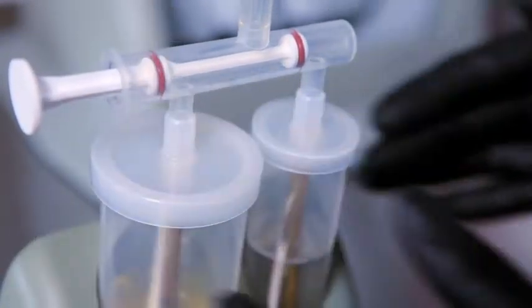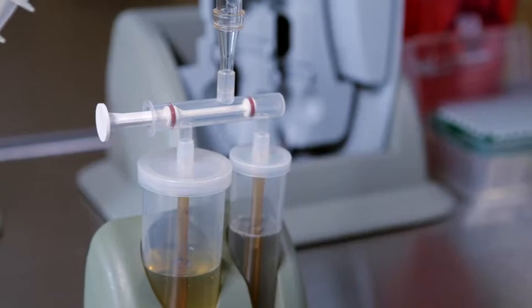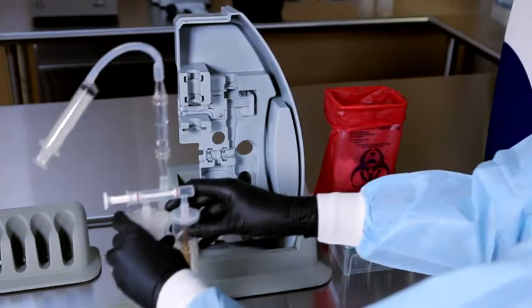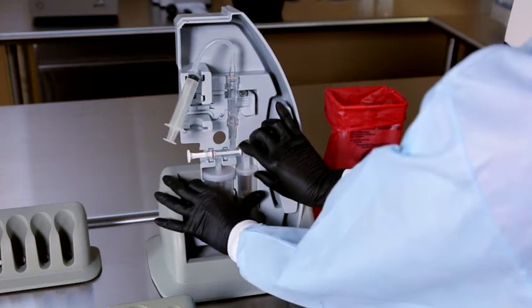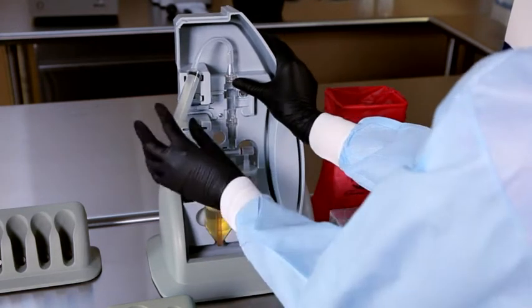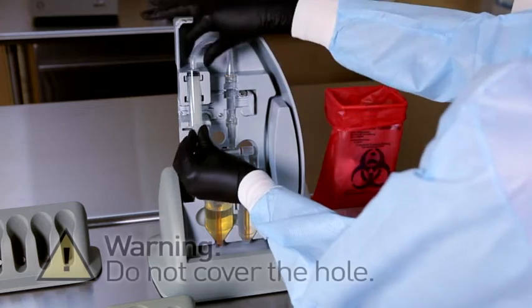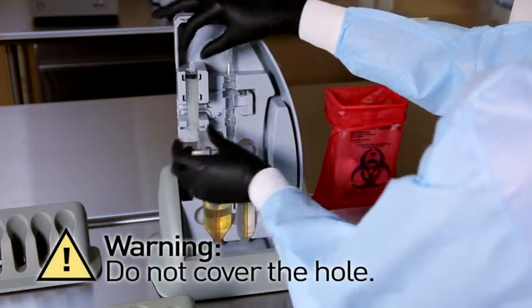Now connect the capture chamber. Insert the valve body into the spout of the sample and elution tube lids. Place the assembled consumable into one of the five cartridge holders. Push firmly on each section to make sure it's placed correctly in the cartridge. Be careful not to cover the hole during this step.